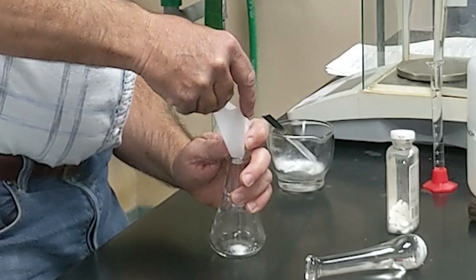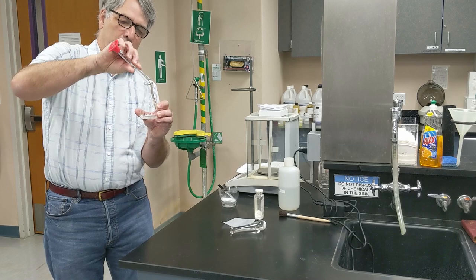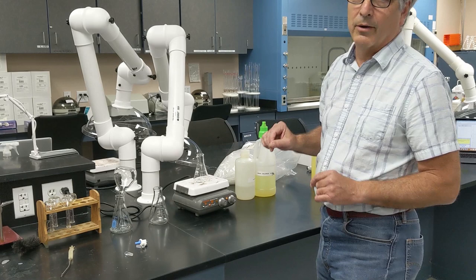And the first step in the preparation is to hydrolyze it. So I'm going to add some sodium hydroxide and put it on the hot plate for about 10 minutes. Well, 5 to 10 minutes. So let's set it around 5 or 6, and then I'll keep an eye on that. Right, and then we'll work out the rest of this a little bit later.